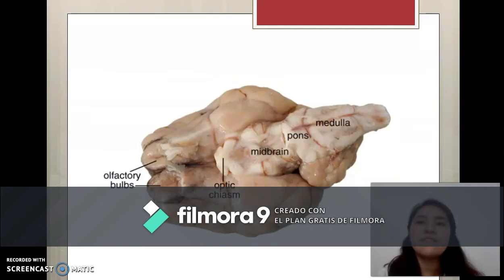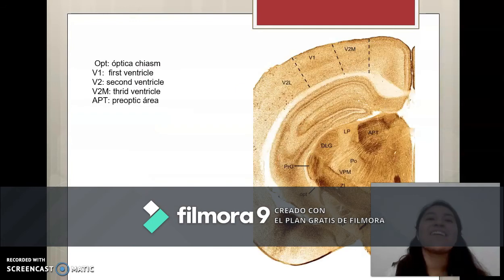Olfactory bulb, a structure located in the forebrain that receives neural input about odors detected by cells in the nasal cavity. The axons of the olfactory receptor cells, the smell receptor cells, extend directly into the nicely organized olfactory bulb, where information about the odor is processed. The hypothalamus extends from the ventral surface of the caudal part of the preoptic area to the caudal border of the suprachiasmatic nucleus. The optic chiasm lies immediately ventral to the suprachiasmatic nucleus and the third ventricle.